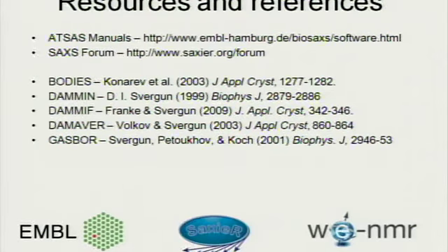Yes, please. How do you treat flexibility? So, flexibility is an interesting topic. In reality, nothing is really solid. Each protein is flexible to a certain degree.